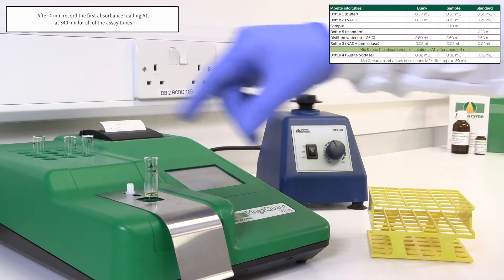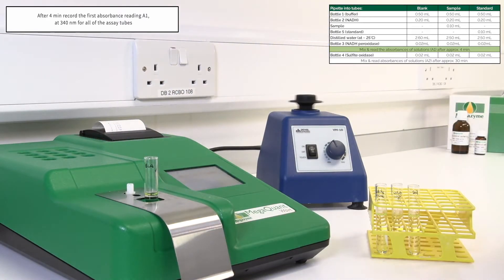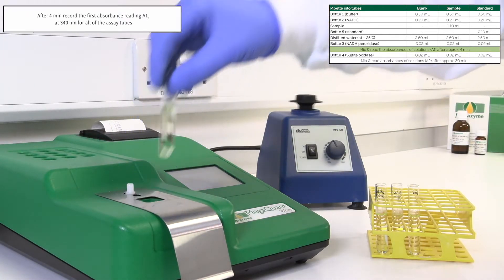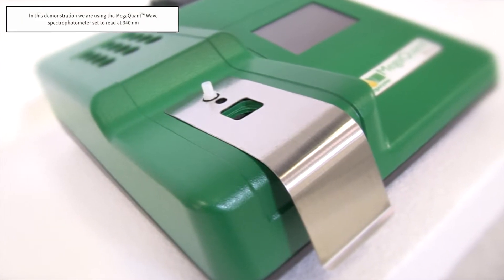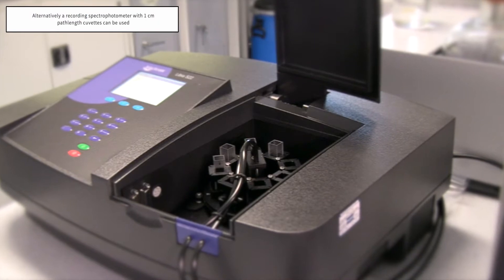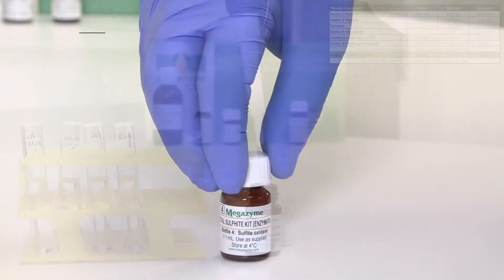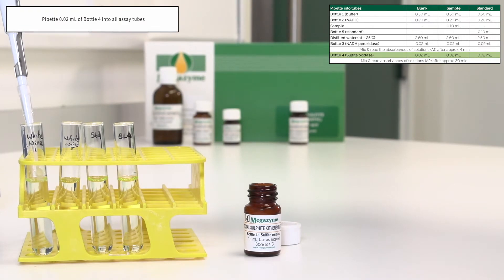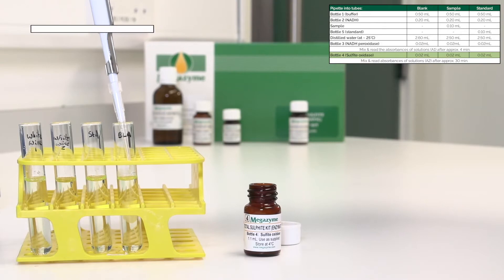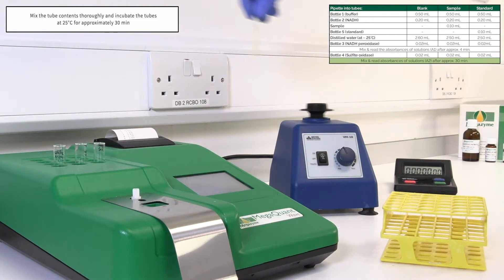After four minutes, record the first absorbance reading A1 at 340 nanometres for all of the assay tubes. In this demonstration we are using the MegaQuant Wave spectrophotometer set to read at 340 nanometres. Alternatively, a recording spectrophotometer with one centimetre path length cuvettes can be used. Swirl to mix the contents of bottle 4, sulphite oxidase, prior to dispensing, and pipette 0.02 millilitres of bottle 4 into all assay tubes.